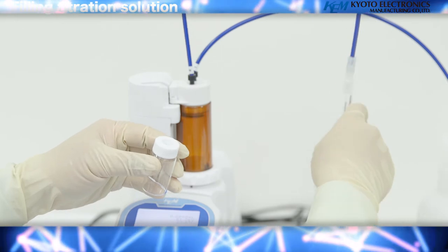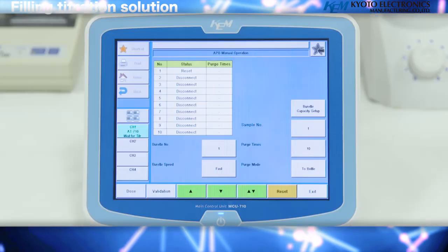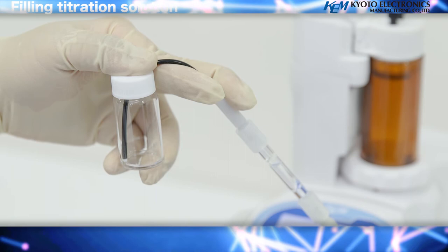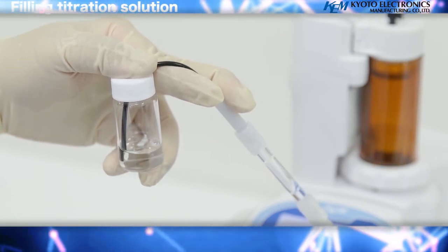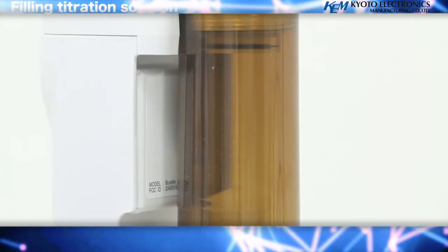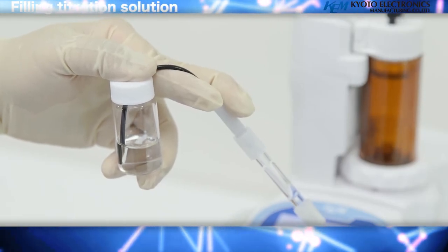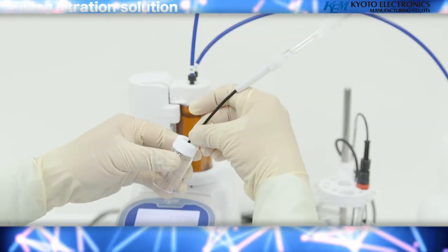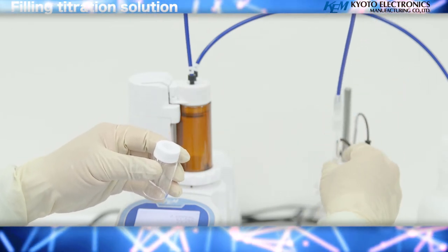Tilt the degassing vial and titration nozzle slightly upward and press the up arrow key to move the air inside the burette to the side where the vial is. When the reagent starts to exit from the tip of the nozzle, push the up arrow key again to stop the piston. Confirm that any air bubbles in the titration nozzle have disappeared, then remove the vial for degassing and attach the titration nozzle to the electrode holder.